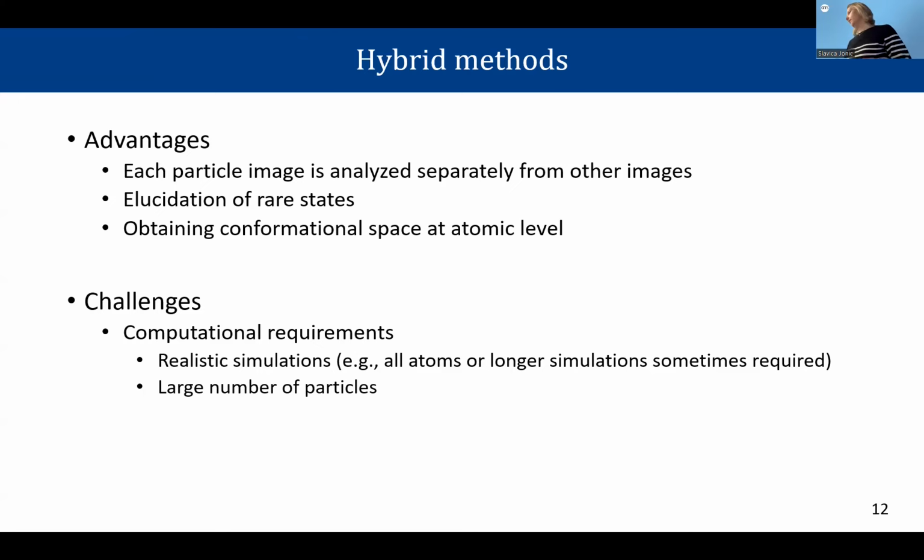Yeah, that's a good question. Your question is about how can we be sure that we are not, for example, stuck in some local optima on the way, and how can we be sure that we really reach this state? Unfortunately, I didn't come to the description of the method yet. Yes, we have one parameter that is helping us a little bit not to get stuck too much with the data.